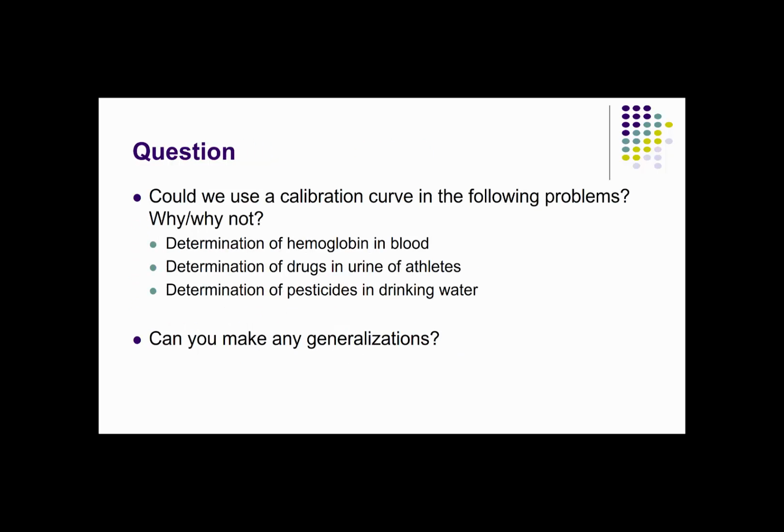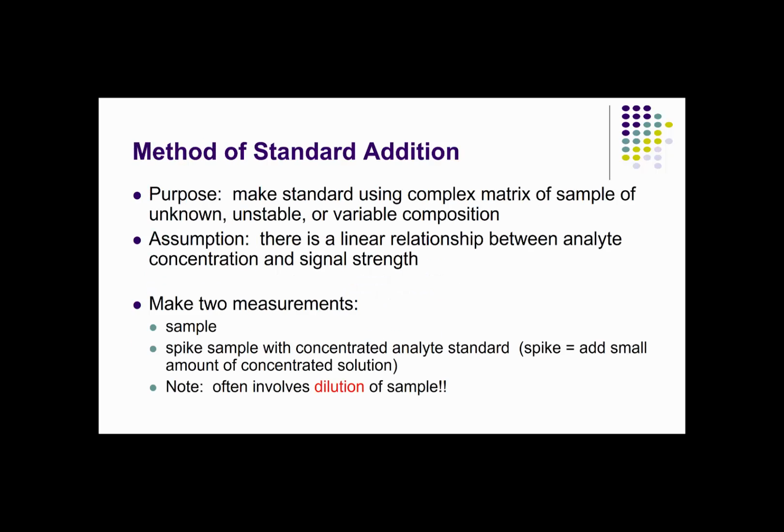Now, at this point, I'd like you to pause and consider for a moment the following question. Could you, or would you, choose to use a calibration curve in analyzing any of the following problems? And if not, why not? Can you make any generalizations here? And that's going to lead me to talk for a few minutes with you about the method of standard addition.